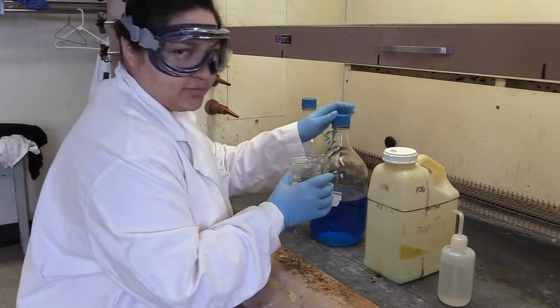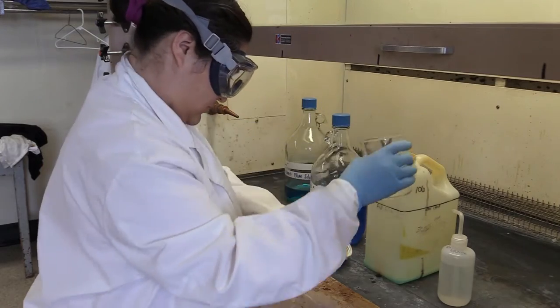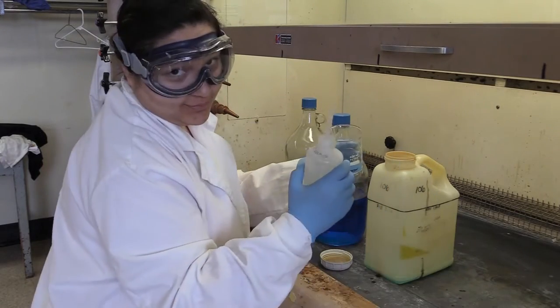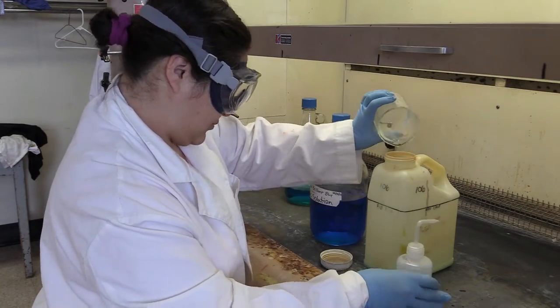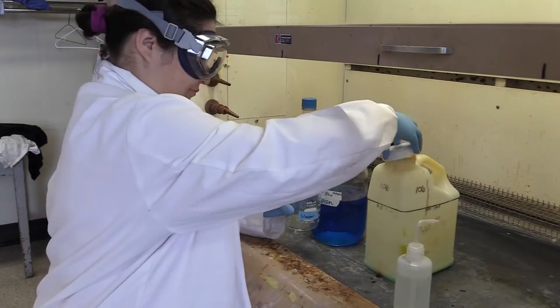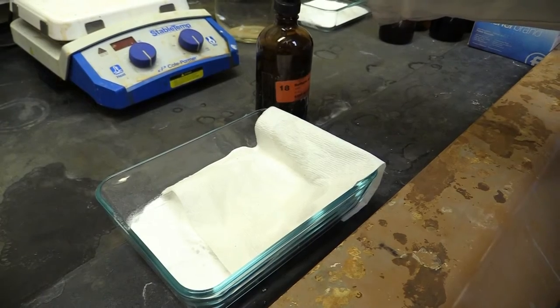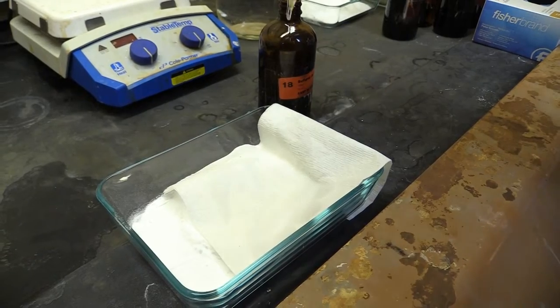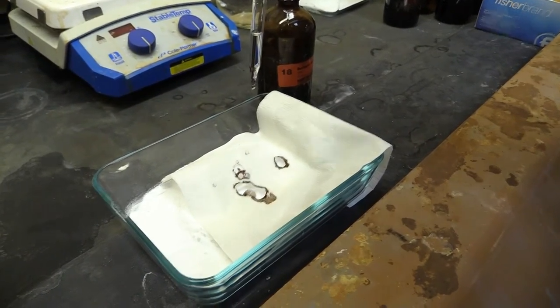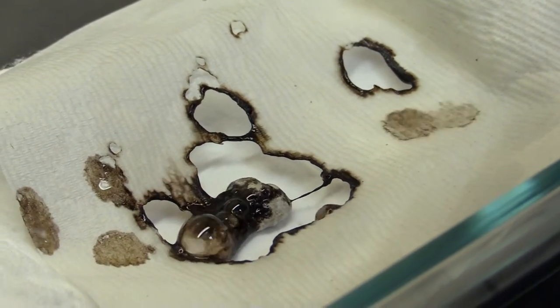If you take some reagent and you find you took too much, don't put the leftovers back in the container you got them from. Just put them in the waste container. Once you take reagent from its bottle, it can become contaminated, and if you put it back, you'll contaminate the rest. Your lab mates won't be happy when their experiment doesn't work because of it. Make sure to use caution when handling your reagents. Some of these are caustic, meaning they can do things like this. Wear gloves when you're handling potentially harmful reagents, like concentrated sulfuric acid.